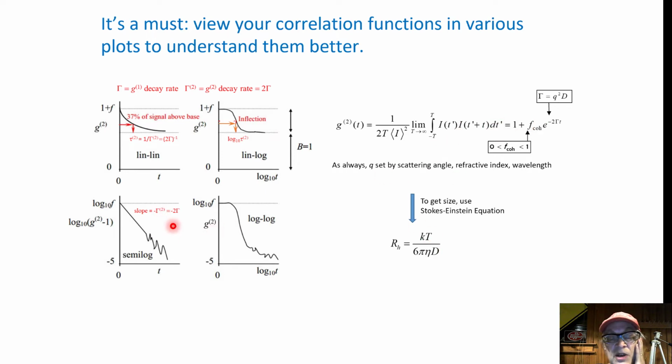And that means that I'm going to tell you a little bit about exponential decays, because they happen not only in light scattering, but in all sorts of other methods like NMR, fluorescence lifetime, creep measurements. There are all sorts of measurements that are exponential or similar to exponentials. Anytime you are doing an exponential measurement, you really want to make 4 plots.